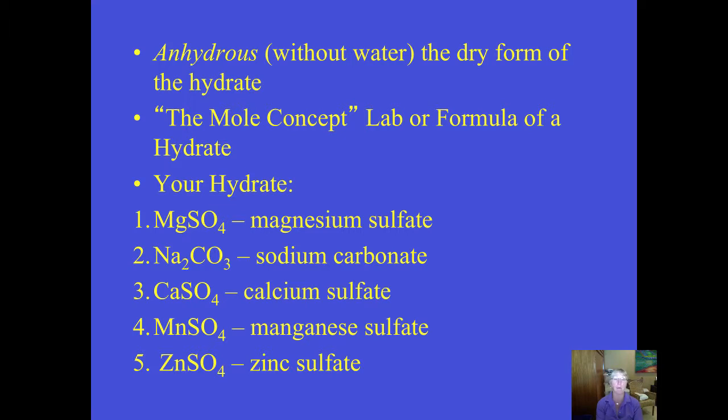Notice that if you get hydrate number 4 with manganese, we have a special disposal method for that. The others will go into the trash can since they're fairly benign, but the manganese is a heavy metal, so it needs its own waste container to go to hazardous waste.